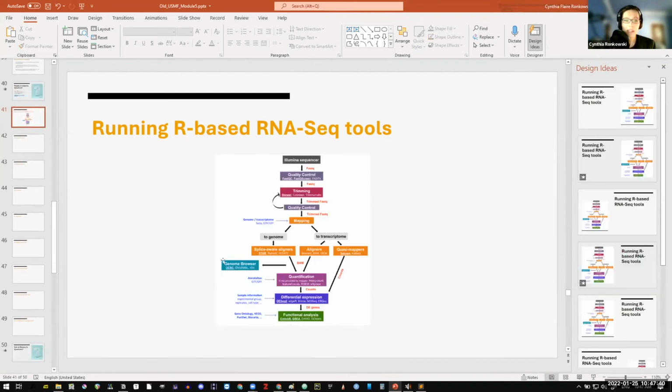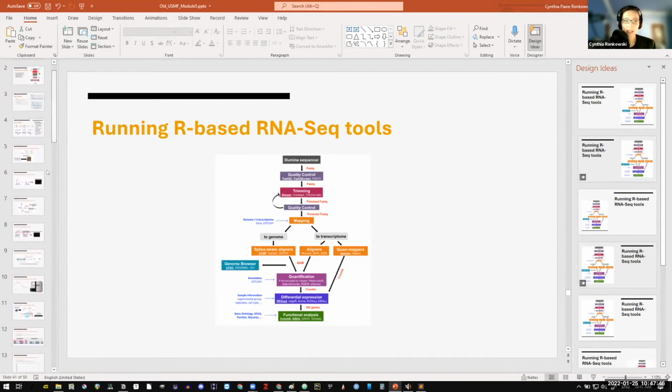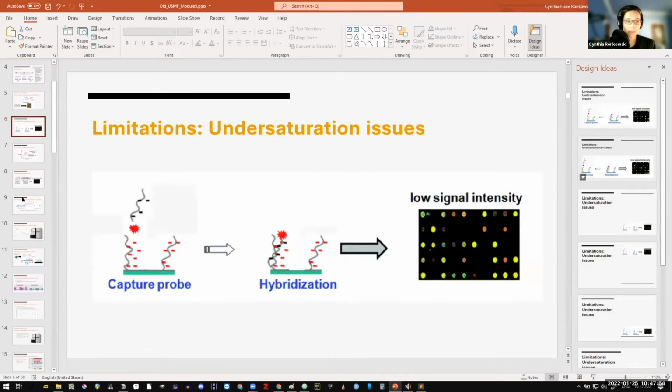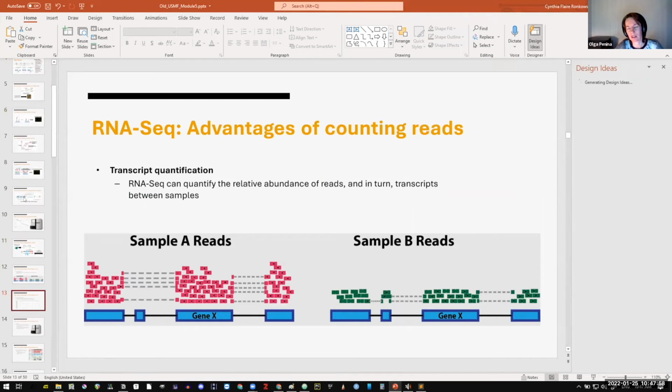And the million itself does not have a unit. It's simply a standard million number that you divide by in order to normalize for sequencing depth. It's like a standardized measure.